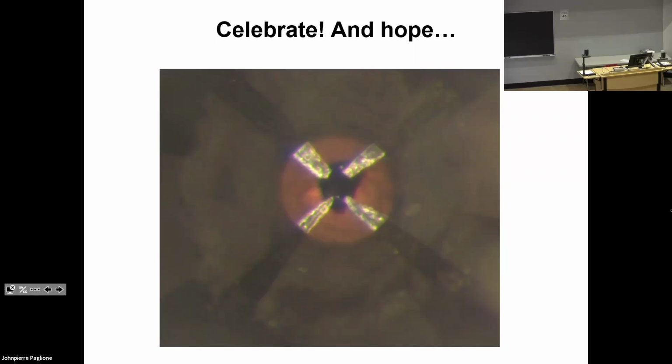And so I usually go for ones maybe on the order of about 10 microns or a little less across. If it's too big, then you often get a lot of strain across that ruby at higher pressures, or it might even crush, or it might get into your sample measurement. But if it's too small, you might actually even envelop it or lose it in your sample. So that's maybe another reason to also potentially load multiple ruby spheres. But yeah, not too big, not too small, maybe on the order of 10 microns across.